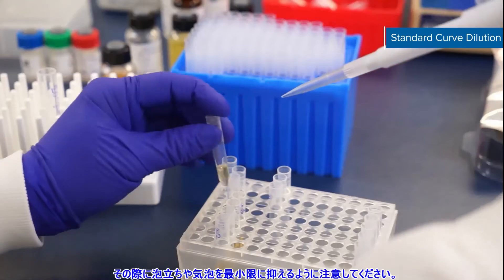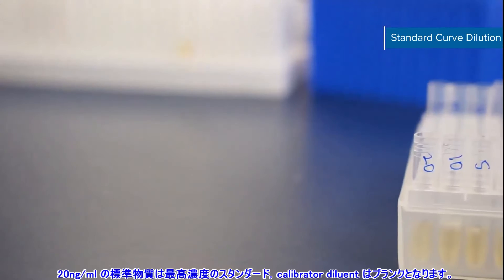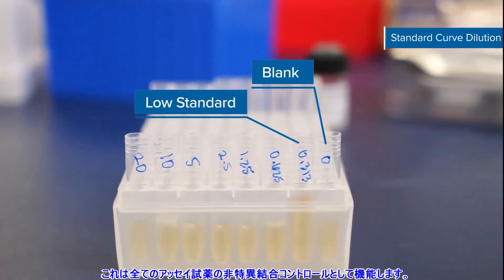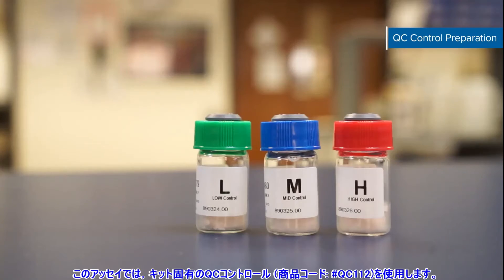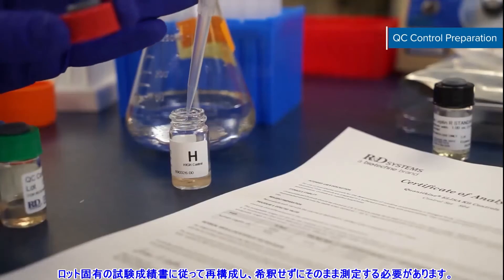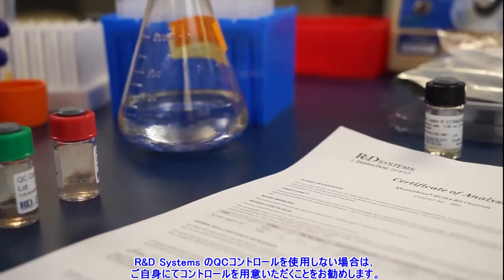Try to minimize foaming and bubbles. Change pipette tips before transferring to the next tube. The 20 nanogram per milliliter standard serves as the high standard and the appropriate calibrator diluent serves as the blank. Blank wells contain zero standard and are treated identically to assay wells. They serve as the non-specific binding control for all the assay reagents. In this assay, we're using the kit-specific R&D Systems QC controls, catalog number QC-112. These should be reconstituted according to their LOT-specific certificate of analysis and analyzed as is without dilution. If you're not using R&D Systems QC controls, we recommend formulating your own control.